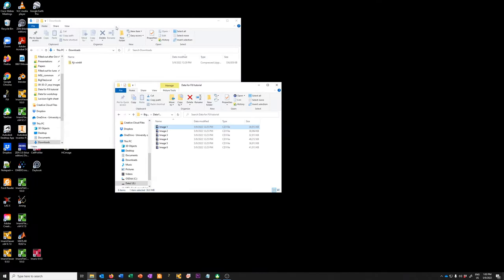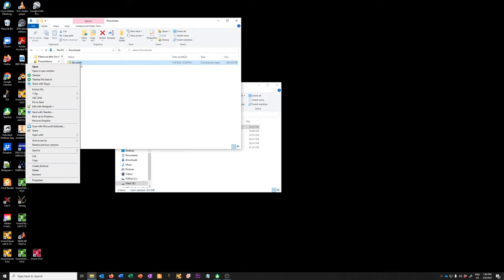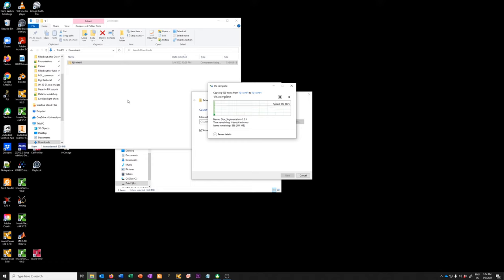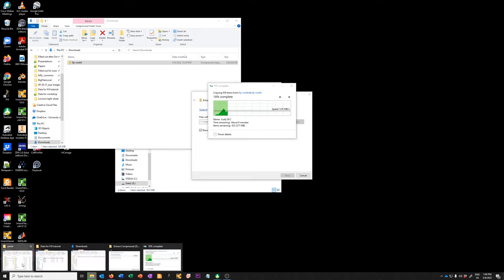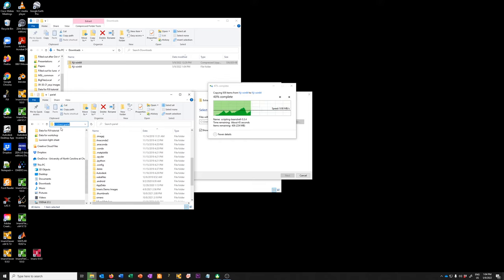Once you select a version to download you'll get a .zip of the Fiji application. All you need to do is right-click on this if you're on a PC and say 'extract all,' which will unzip those files into a folder you can put wherever you want. However, on Windows you want to put it in your user space — something like C:\Users\[your username] — rather than inside C:\Program Files, because if you put it there it has trouble updating.